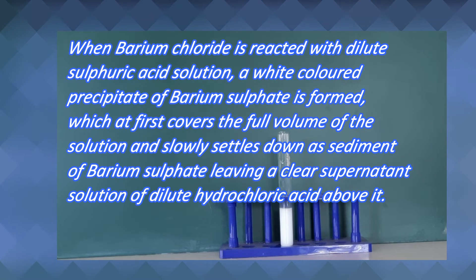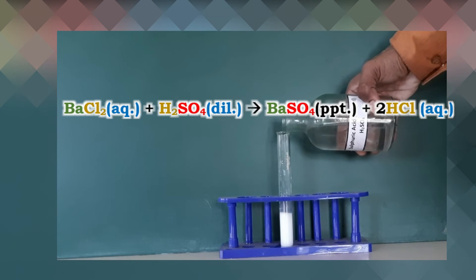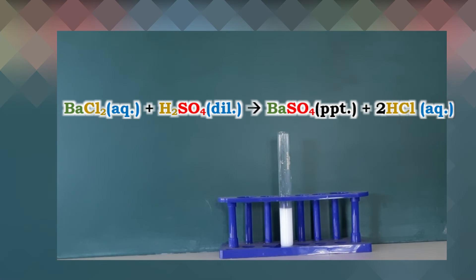clear supernatant solution of dilute hydrochloric acid above it. The reaction taking place is: BaCl2 plus H2SO4 gives BaSO4 plus 2HCl.